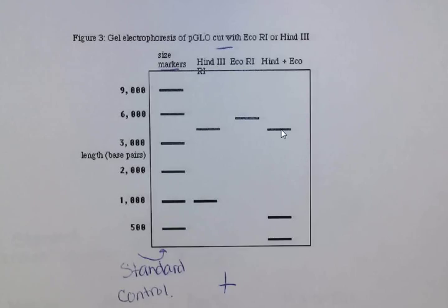And so when we were doing criminal cases, what we will do is we will take a look and try to match up the banding patterns from a victim or a suspect and match them to hopefully the person who did the crime. Today what we're going to do though is go through and take a look at how to analyze this data so that we can hopefully map some genes or some chromosomes and figure out where everything is in relationship to each other. And so the first step in that is to take some fragments and run them through the DNA profile.